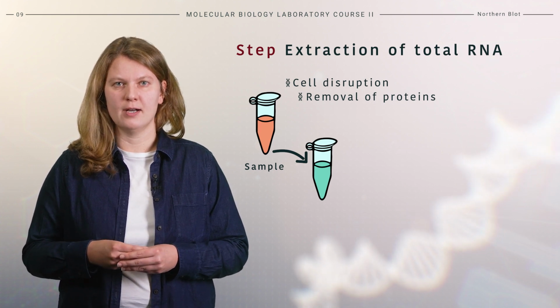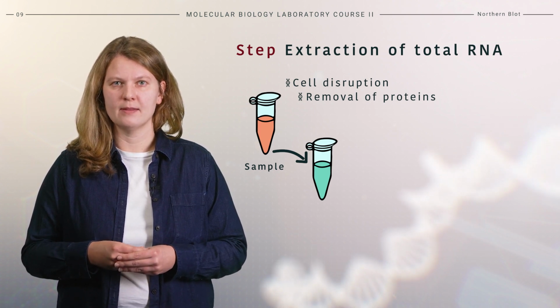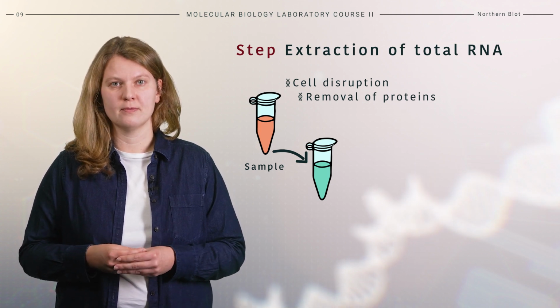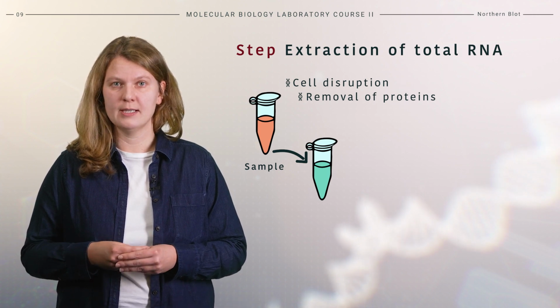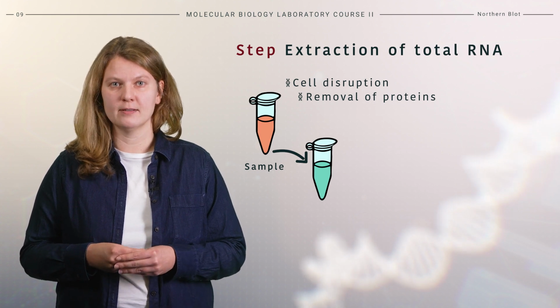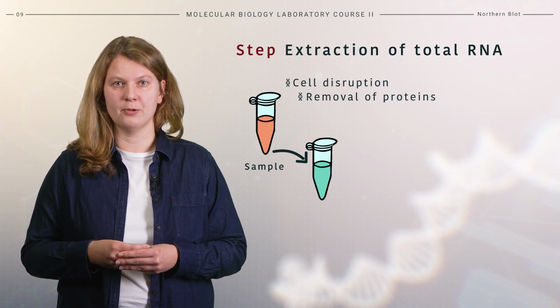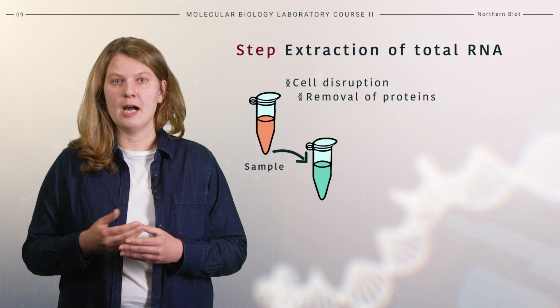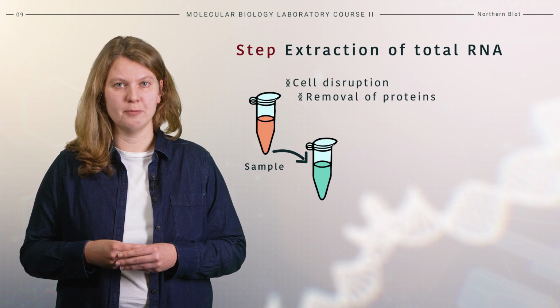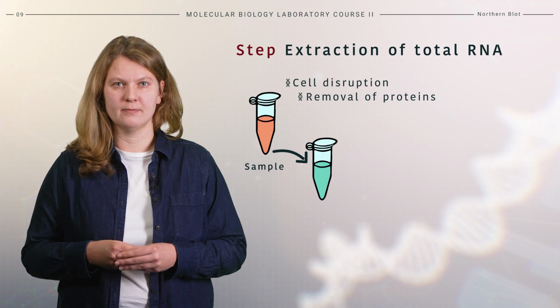Organic extraction methods are common for RNA isolation. During this process, the sample is homogenized in a phenol-containing solution and then centrifuged. During the centrifugation, the sample separates into distinct phases, and the process is also pH dependent. These are the lower organic phase and the interphase, containing denatured proteins and genomic DNA, and an upper aqueous phase containing RNA. The aqueous phase is carefully removed, and RNA is collected by alcohol precipitation and rehydration.